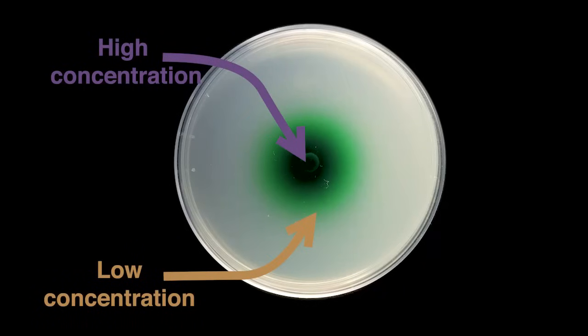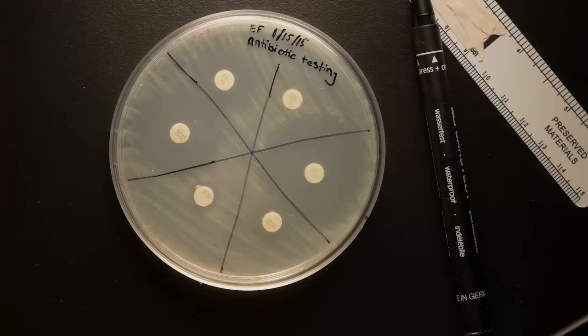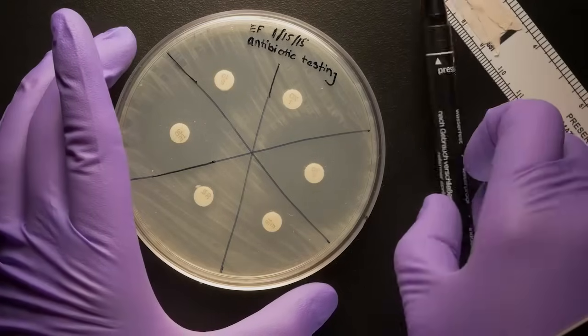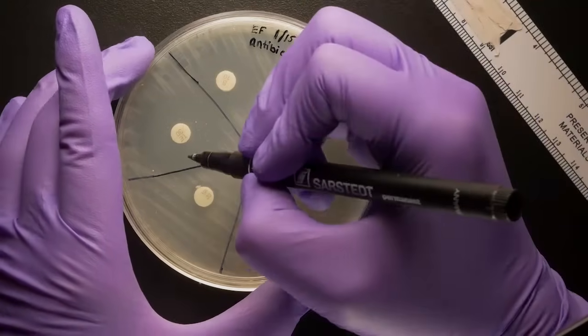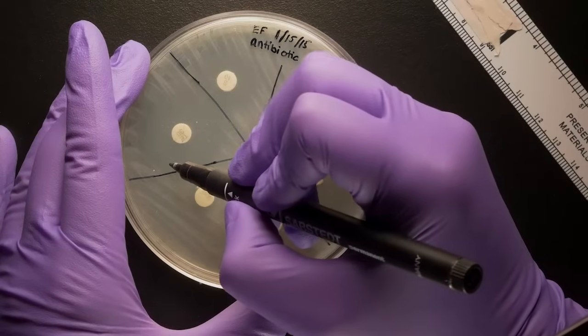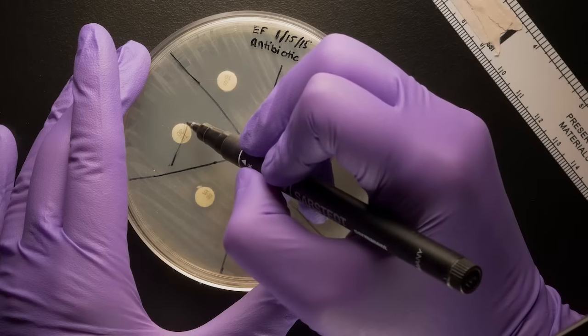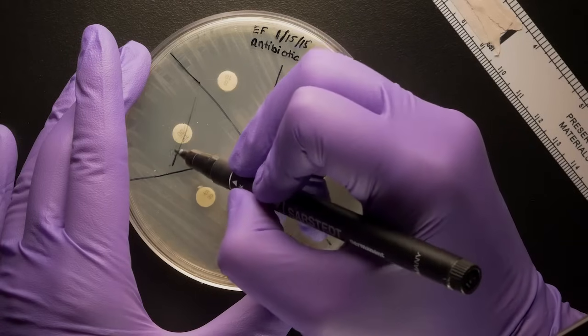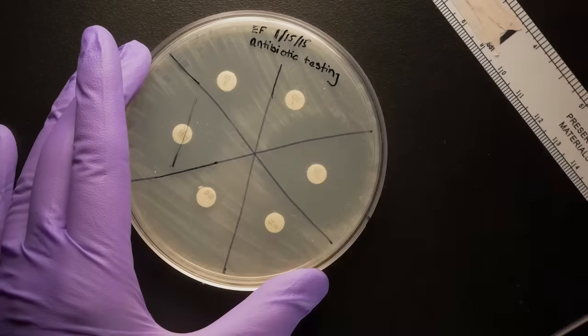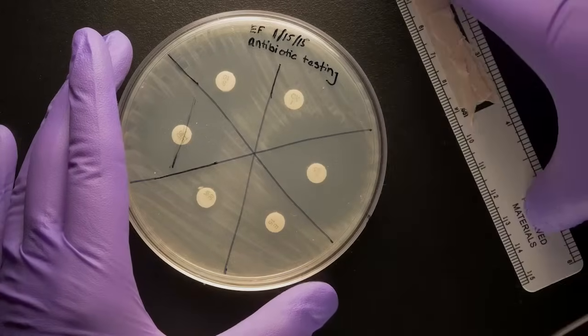Remember how the antibiotic is most concentrated near the disc? Well, what concentration do we need to kill the bacteria? You can measure the diameter of the clearing to determine how susceptible the bacteria is. You can draw a line with a marker to help you measure. Be sure you measure in millimeters.